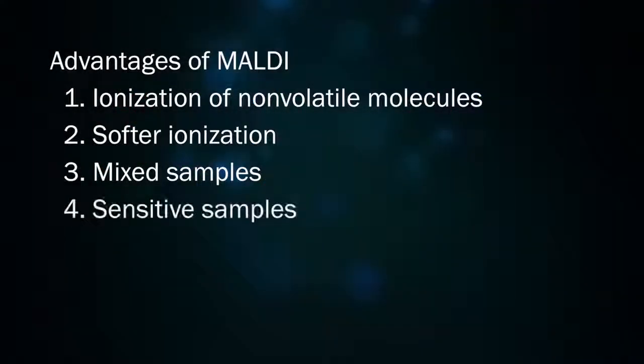Because there's no heated injection chamber, like in other forms of ionization, MALDI allows for the analysis of sensitive molecules that would decompose under high temperatures.